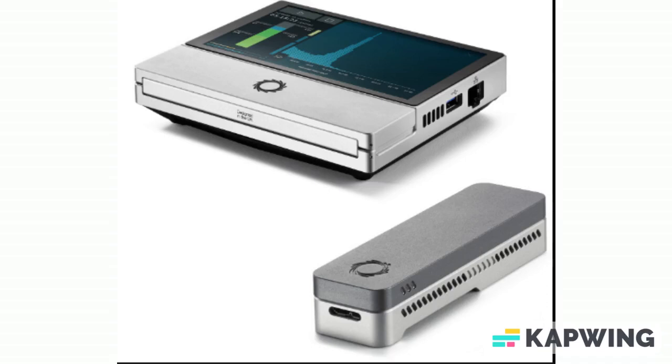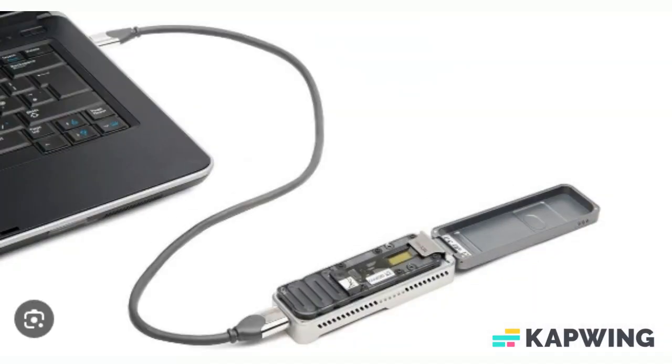Oxford Nanopore sequencing (ONT) was developed as a technique to determine the order of nucleotides in a DNA sequence. In 2014, Oxford Nanopore Technologies released the MinION device, which promises to generate longer reads that will ensure a better resolution of structural genomic variants and repeat content.